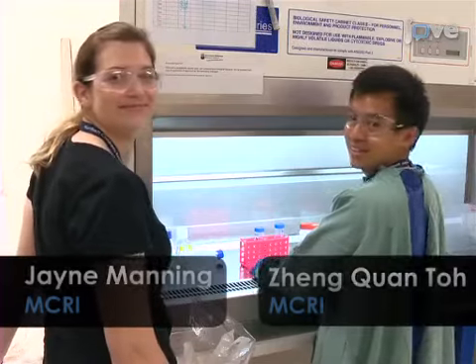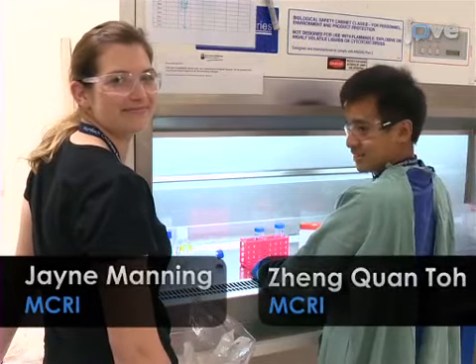We first had the idea for this method when we began investigating the potential use of Lactobacillus rhamnosus GG and other probiotics in the respiratory tract. Demonstrating this procedure will be Jayne Manning and Zheng, PhD students from our laboratory.